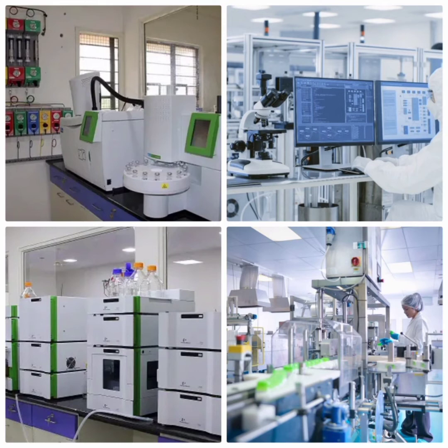So when deciding between the two, it's really not a question of instrument superiority, but the effectiveness for the sample of interest. My advice to you is to evaluate the sample based on factors described in this article, and also weigh your options with as much information as you can get. And now it's up to you to make the final decision.